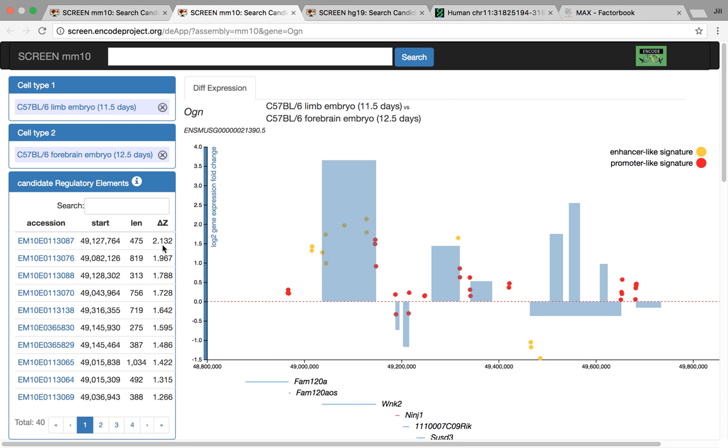On the main screen here, we have a fold change of expression. We then also have, in dots, all of the enhancer-like signature and promoter-like signature CREs in this region.